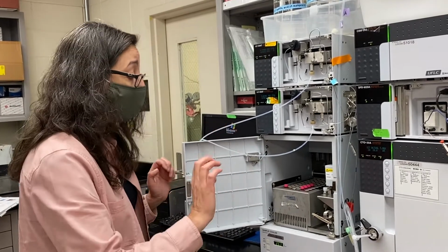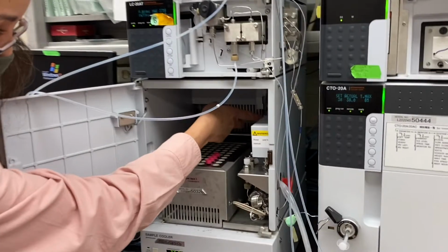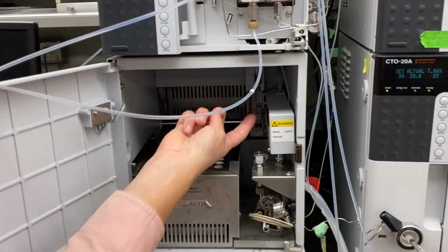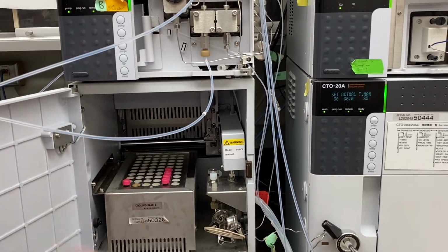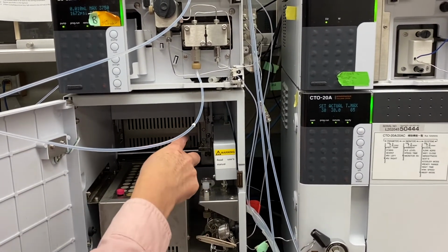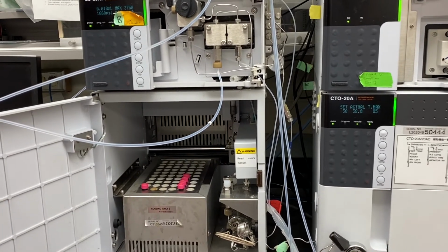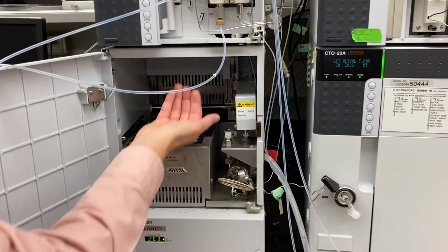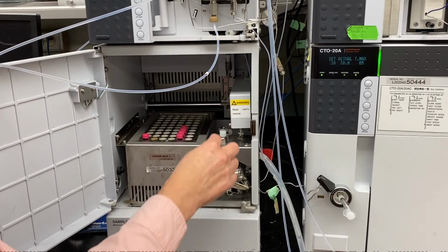So you will see that in a minute where the needle comes to the front. So you have the needle, it comes to the front, and then goes in this compartment to do rinsing. So the first thing, the needle needs to be rinsed really well from previous injections so you don't have any contamination. So the needle is going to come in and get the rinsing going.